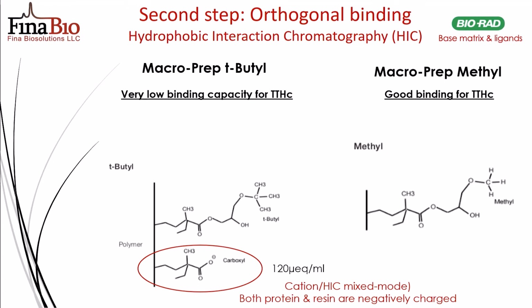You'll notice here also that, in fact, these are not really strictly only hydrophobic resins. Even here, there are other interactions in the ester linkage of the methyl group and with the additional hydroxyl group. So really, even though these are called HIC resins, they really both have elements of mixed mode chromatography.